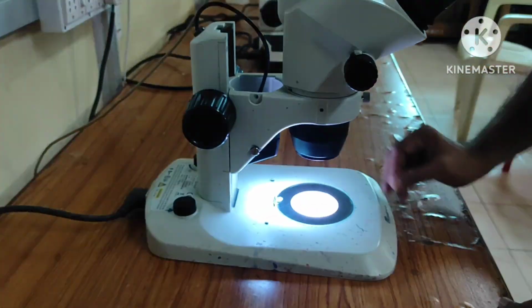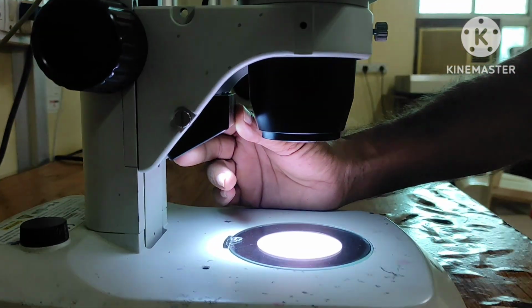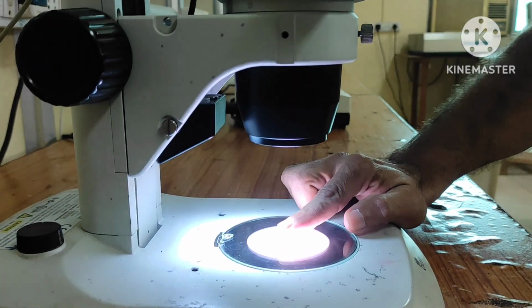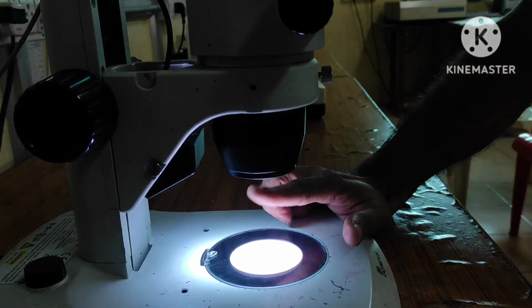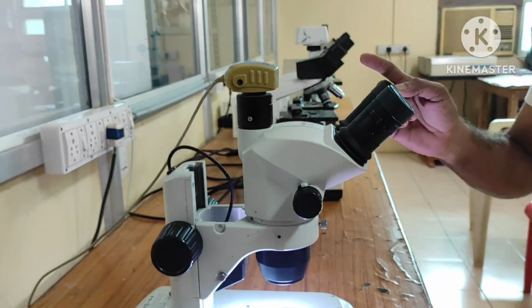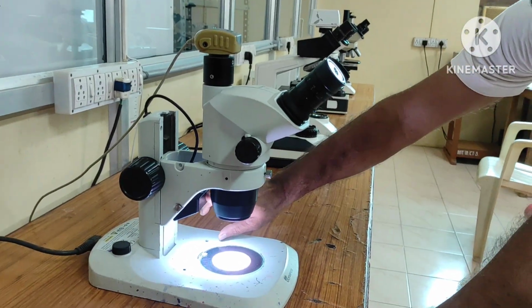Here this is the source of light, actually LED light, right. So light used to fall on the specimen, and the light reflected from the specimen used to go to the lenses, the objective lens, then the eyepieces, right. So that image used to be created in the eyepieces, which we can observe here. So the source of light is here now.